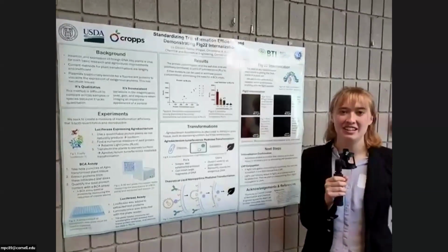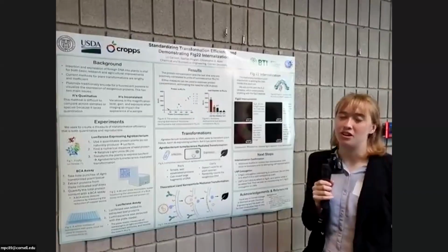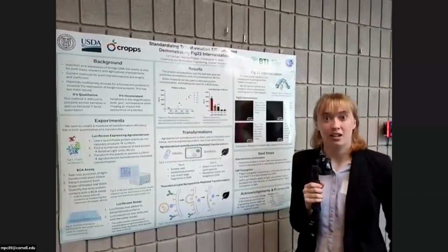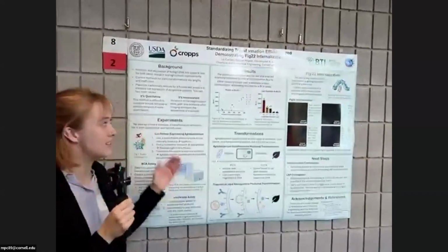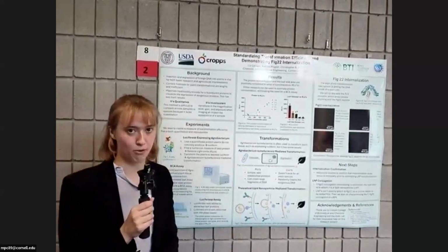Hi, my name is Liz Carlsen, and today I'm going to be talking to you about standardizing transformation efficiency and demonstrating FLG22 internalization. To start off with, plant transformation is a very useful technique. We use it for everything from basic research to crop improvement.